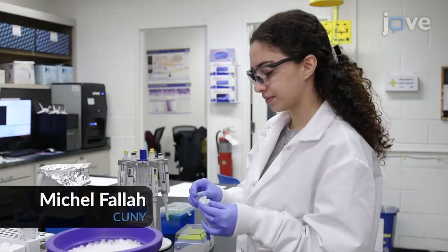This method allows further investigation of the role of epigenetic marks in neurodegenerative disease and can be modified for the assessment of human fibroblasts and induced pluripotent stem cells. This particular method contains a number of details that need to be demonstrated visually, such as the proper loading of the Western blot apparatus. Demonstrating the procedure will be Michel Fallah and Navin Rana, both undergraduate researchers in the Torrente laboratory.